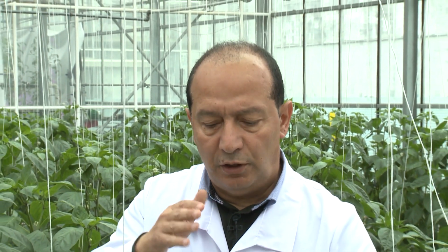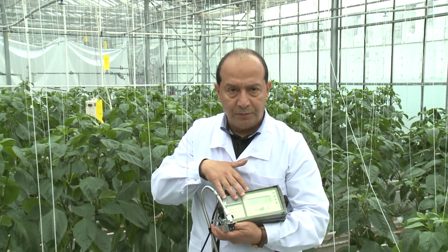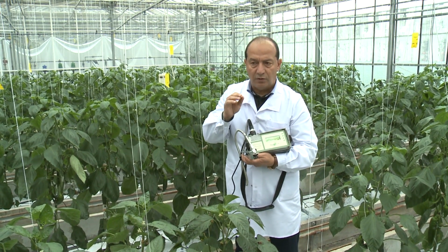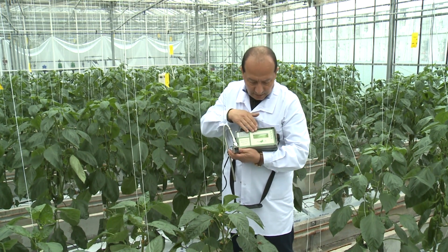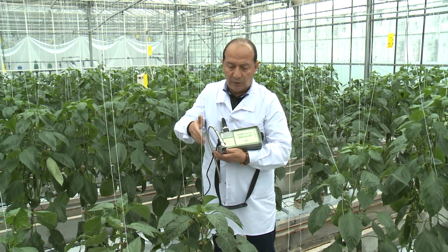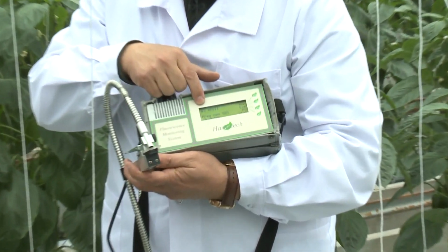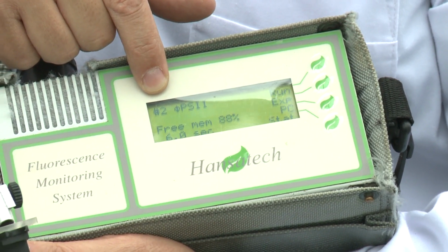We are listening to the heartbeat of the plants, which we call photosystem 2. And again, as I said, after dark adaptation, this is a fixed value for most of the plants in the world. It's about 0.83 to 0.85 for the parameter FV/FM, while in this case, for the measurements of PhiPSII, the parameter which we get while doing the actual chlorophyll fluorescence or photosynthesis activity measurements, we have values of about 0.78 to 0.79. And this is the optimal value for most of the plants.